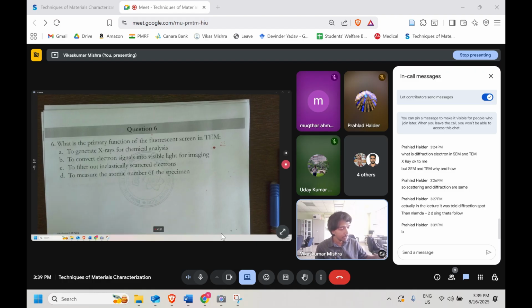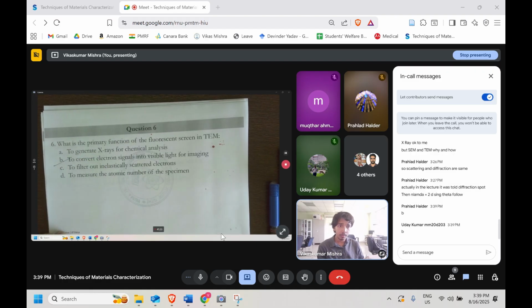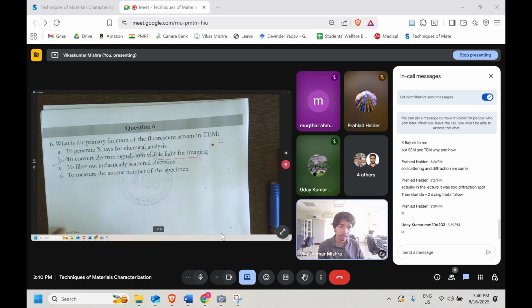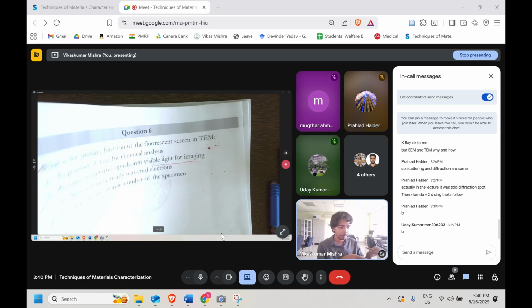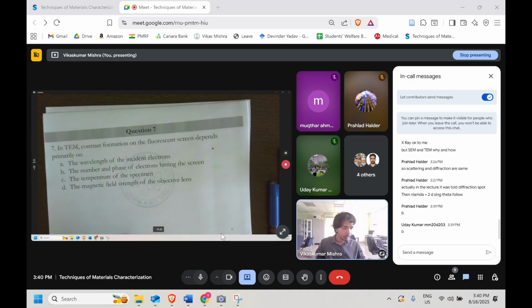Very good, Prahlad. Option B is the right answer. Yes, Uday, option B is the one. It's the one which is going to convert the electron signal, which our eye cannot see, to visible light for imaging. Okay, so with that, question number 6 is over. Any doubt, guys? Let me know.